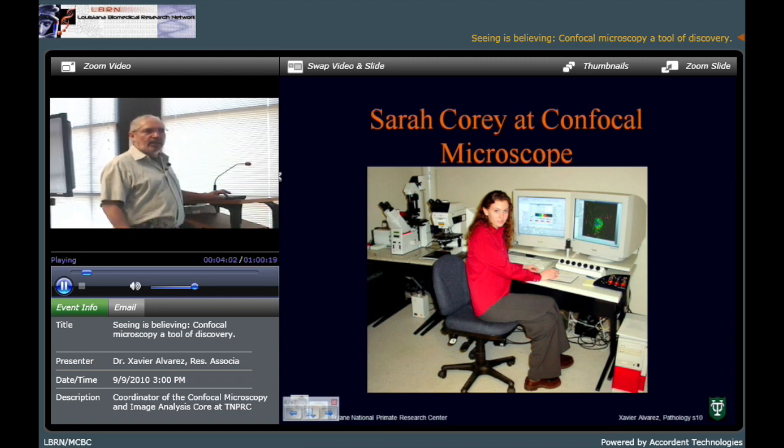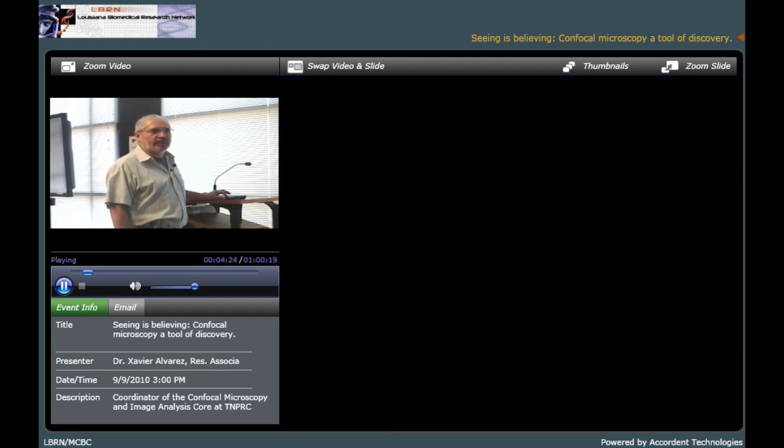That is the confocal microscope that we have. It is an SP2. When I tell everybody it's an old one, I want a new one. We have a grant application for a new confocal microscope. Okay. After November, I could tell you if we have a new one.